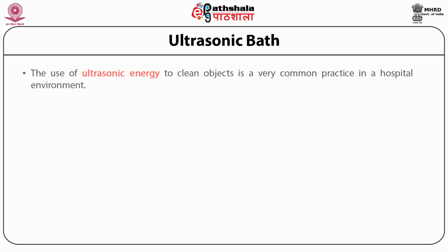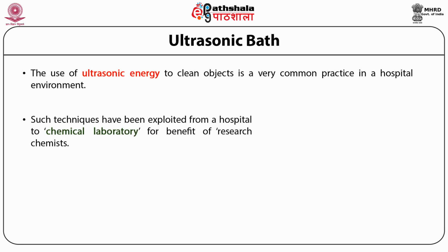The use of ultrasonic energy to clean objects, including medical and surgical instruments, is a very common practice in a hospital environment. Importantly, such sophisticated techniques have also been exploited, from a highly sensitive sterile zone of an operation theater in a hospital to the chemical laboratory, for the benefit of research chemists as well.